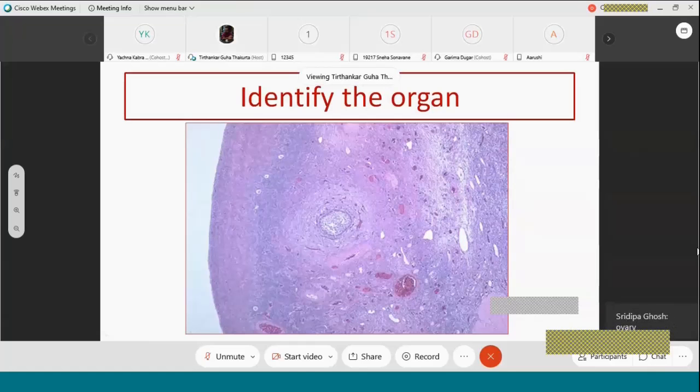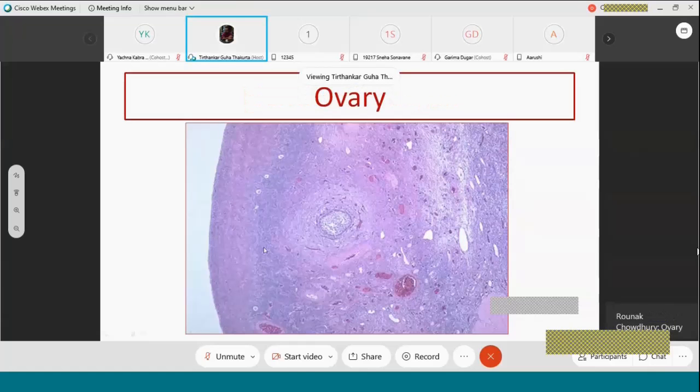This is very good. So this is the ovary. This is typically how ovarian stroma looks like, a compact, dense stroma. You can see here these small round areas with small cells inside it. These are the primordial follicles. And this is the developing follicle, this round big thing inside. This is the developing follicle.